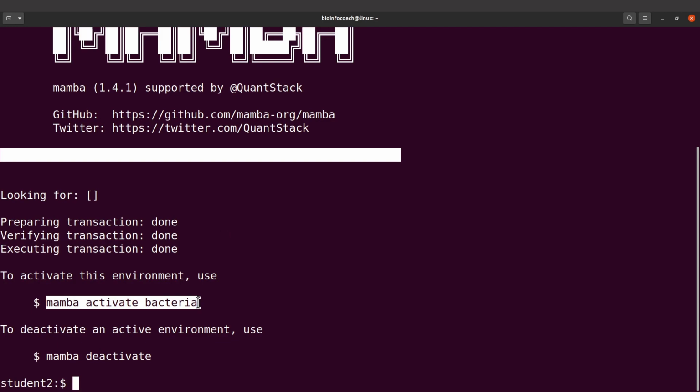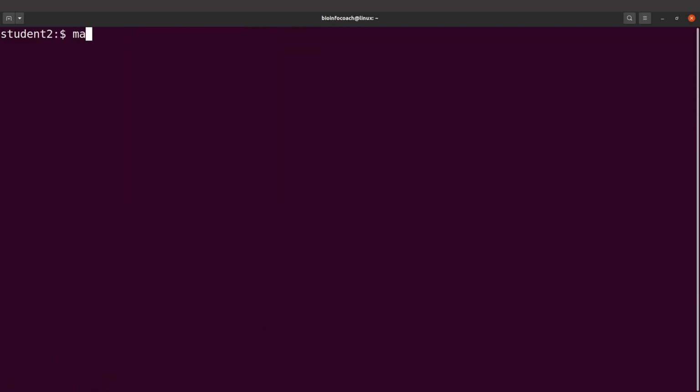If you created it using micromamba, then you have to specify it here in place of this. All right, so let's activate the environment. So I'll say mamba activate bacteria. So let's execute this command. All right, the environment has been activated.